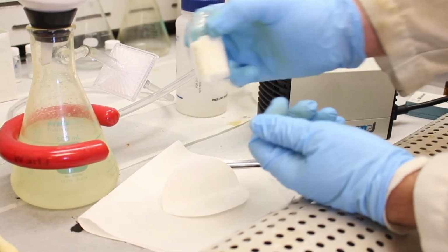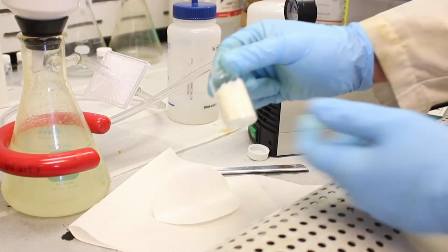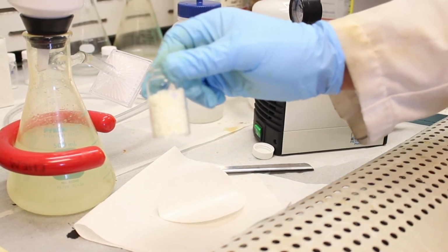This is fairly heavy right now. I can even feel it, and that's probably because there's a lot of water in here. So as usual, we're going to place this in a vacuum desiccator, try to get all the water out, and then we'll get an accurate mass.